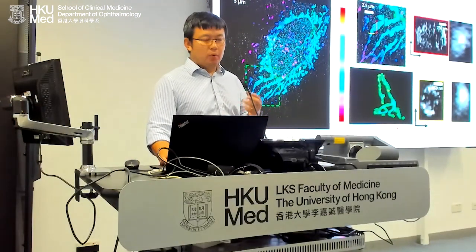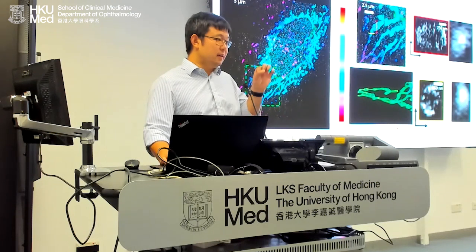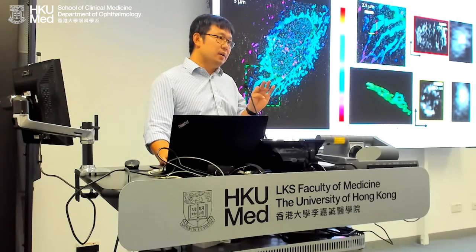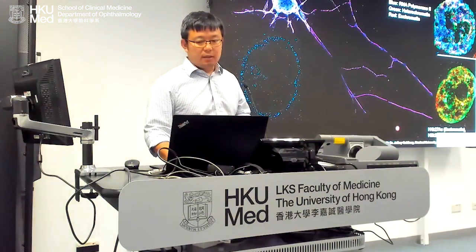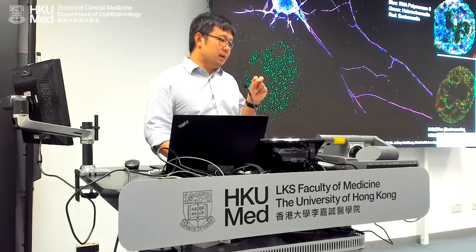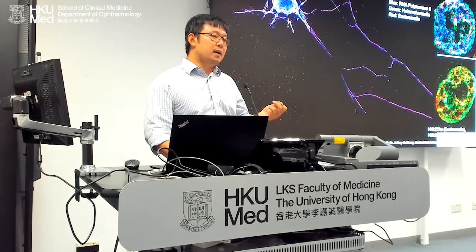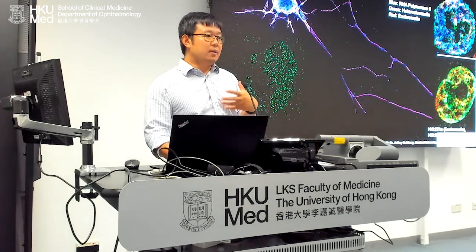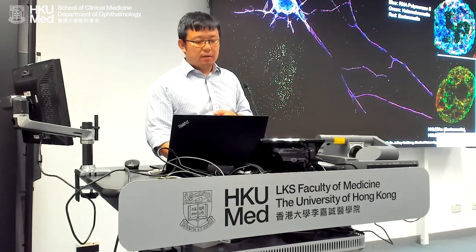Without going into the details, how are we using this? One study is to quantify the mitochondrial damage in cancer cells and in diabetic retinal epithelial cells. Another study is chromatin imaging. So these are whole nuclei where we quantify the histone markers that are associated with epigenomic modification when we apply chemotherapy, for example, trying to understand why different cells survive the chemotherapy, why different cells can be killed by the chemotherapy.